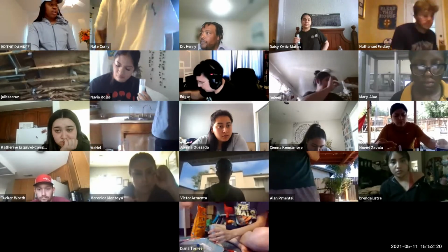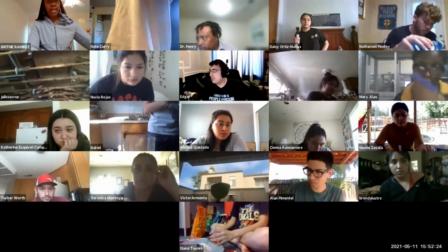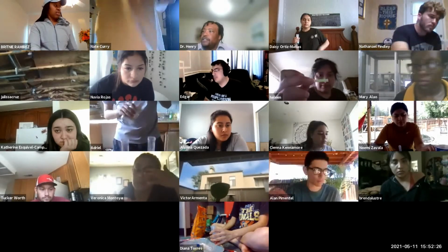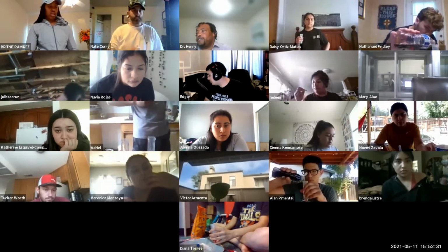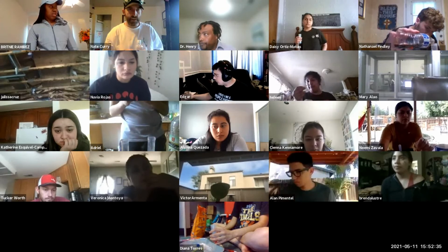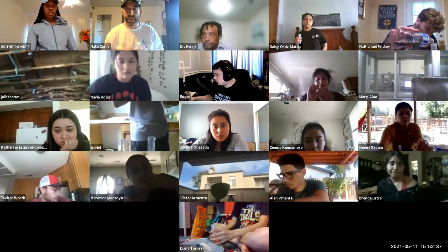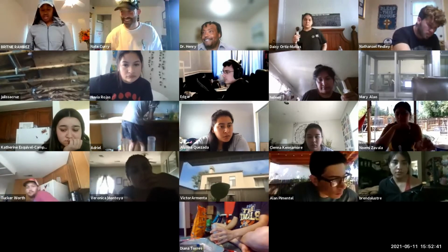That's a lot of messages. Let me read the messages. I don't have that comparison pH chart you were talking about. Yes, you're supposed to add the 50 mils to the empty water bottle. Sorry, Victor. That's because Hartnell printed our strips in black and white. Did they really print them in black and white? I don't know.